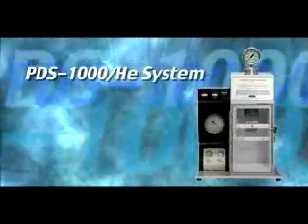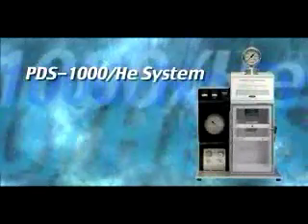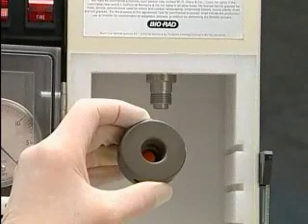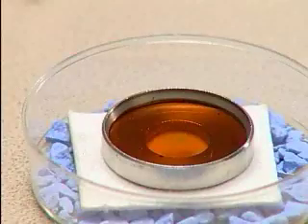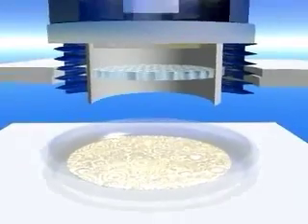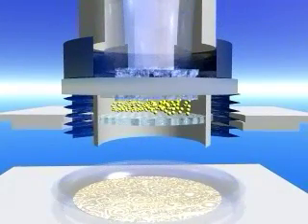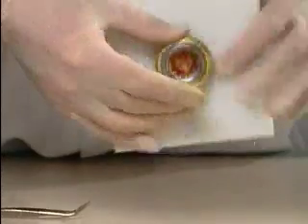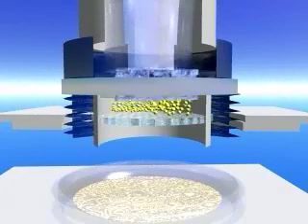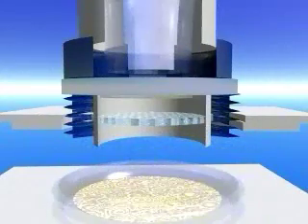The BioListic PDS-1000 Helium System uses high-pressure helium released by a rupture disc and partial vacuum to propel a macrocarrier sheet loaded with gold or tungsten microcarriers towards target cells at high velocity. The microcarriers are coated with DNA or other biological material for transformation. The macrocarrier is halted by a stopping screen, and the DNA-coated microcarriers continue traveling towards the target to penetrate and transform the cells.